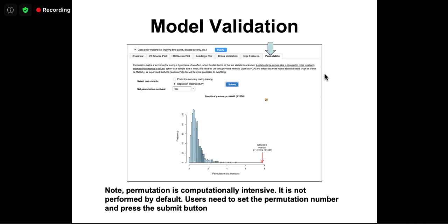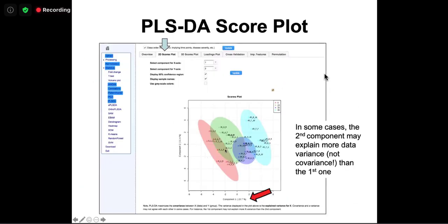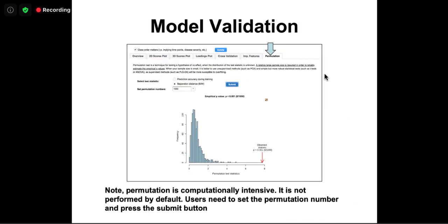And the separation is basically we use an ANOVA-based approach, between-group versus within-group separation. So this is like an ANOVA, where we compare between and within. If the between-group separation is always much larger than the within-group, you are safe.